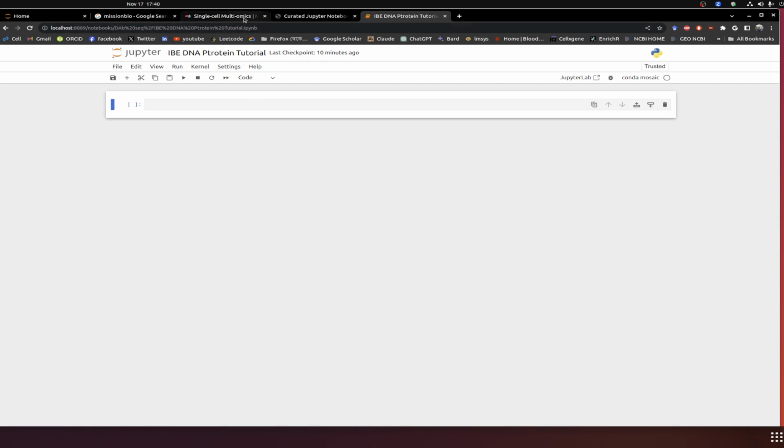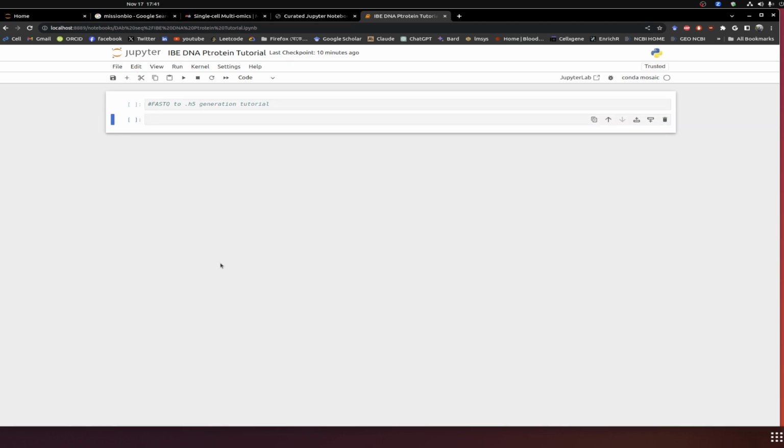They have a specific cloud environment where you just need to upload it. I can show it separately at a different time. I will show it definitely. I just forgot. Let me write it down. I'll show it. And then you will get the .h5 files.